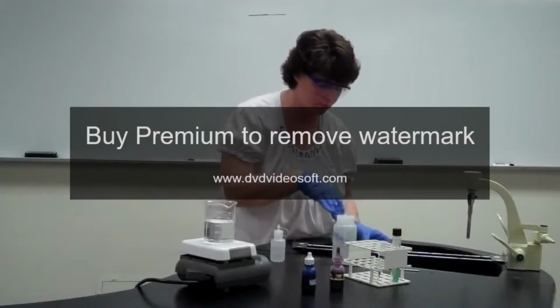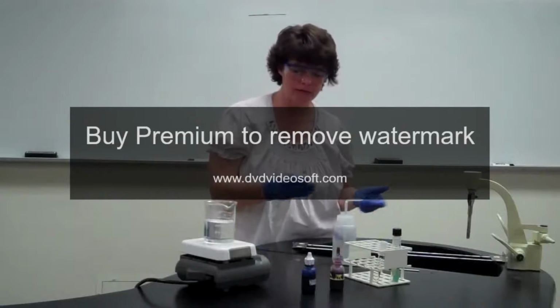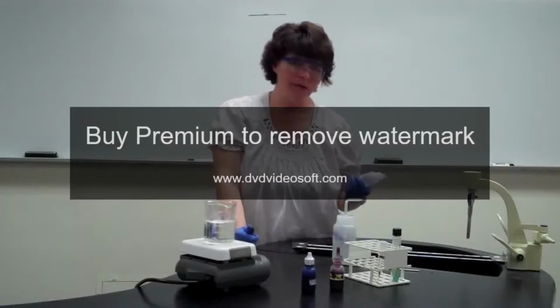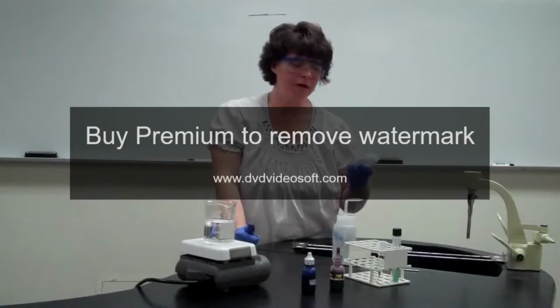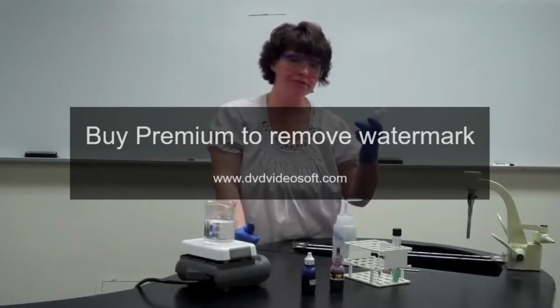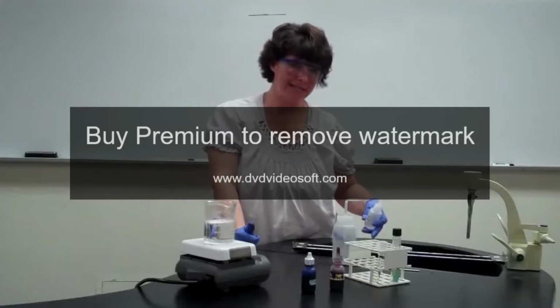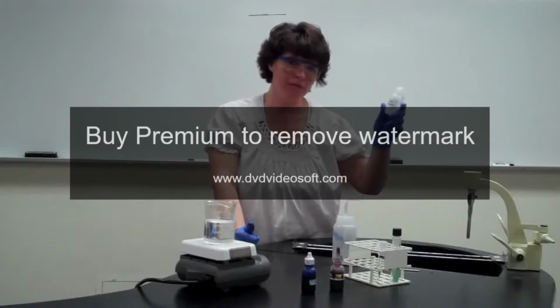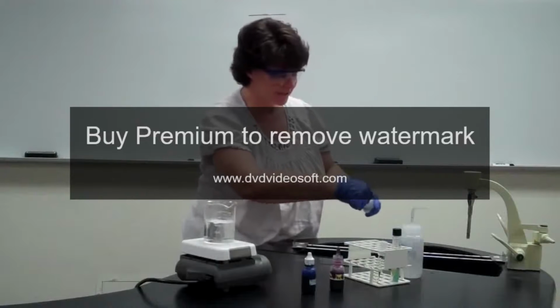Okay, just the same as with the gram stain procedure. The next step in the gram stain was the mordant, but we're not going to do one of those here. The next step is going to be the decolorizing. If you recall from the gram stain, the decolorizer was either alcohol or acetone alcohol. In this, it's going to be acid alcohol. The reason that we use acid alcohol is because if a cell is acid fast positive, it won't decolorize even in the presence of acid. Okay, so we're going to use acid alcohol for our decolorization.